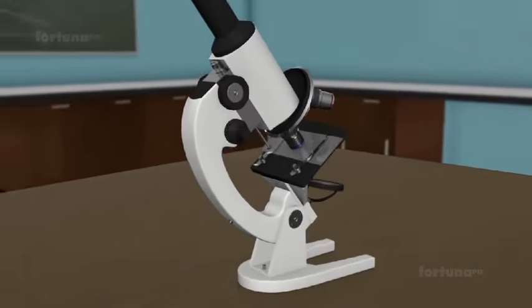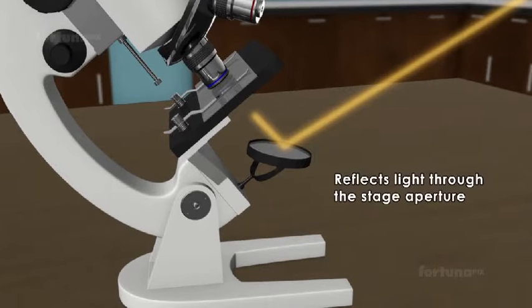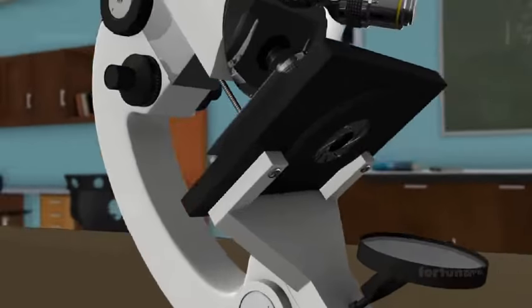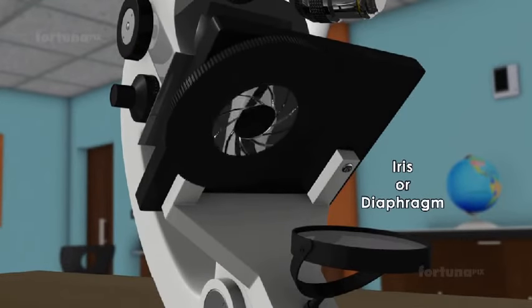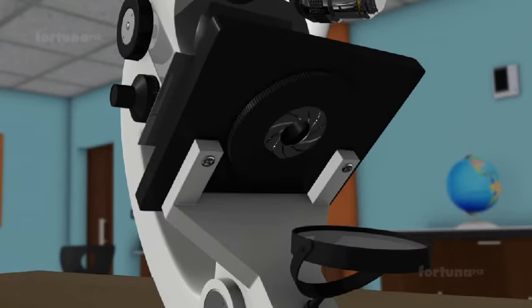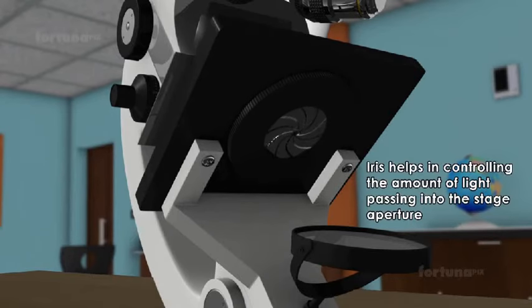A small mirror at the base of the microscope reflects the light through the stage aperture. Above the mirror, an iris, also known as a diaphragm, is present. The iris helps in controlling the amount of light passing into the stage aperture.